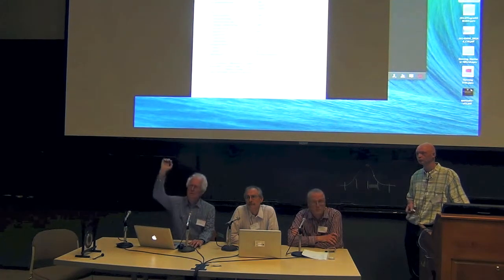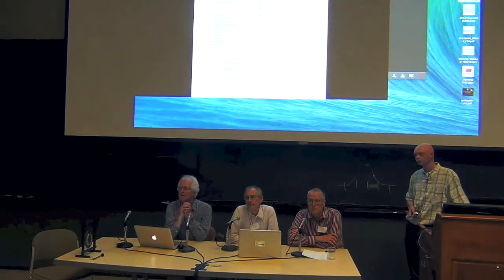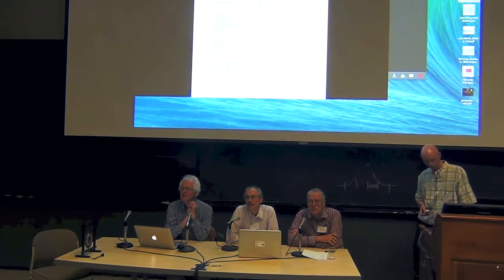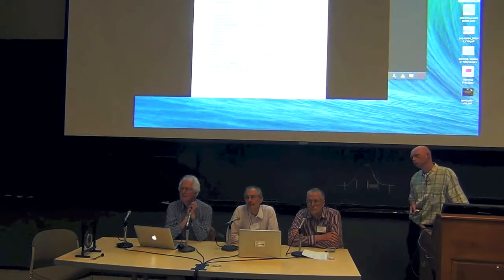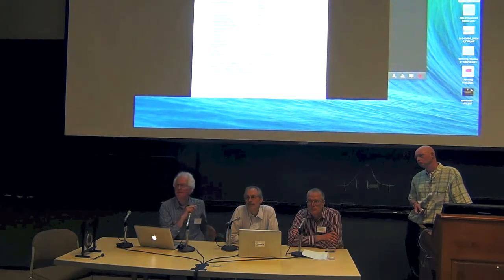Yeah, I agree with that part. I just want to compare because I saw something like 1.5 angstrom resolution data, and the other guy saw something similar. But I don't want to compromise just to make my Table 1 look beautiful. I got something like 1.7.